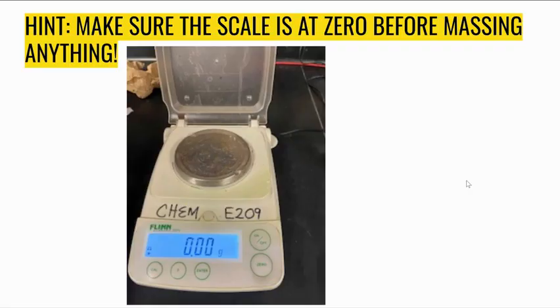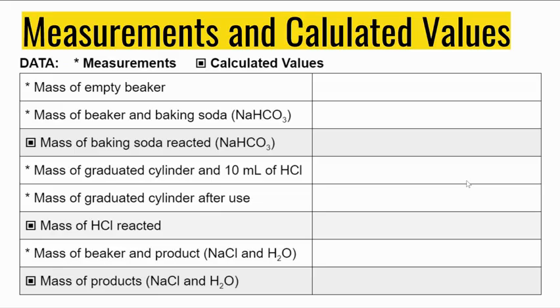One big hint is to make sure that the scale always reads 0 before you mass anything. Small errors in mass measurements become part of writing an error analysis and a percent error statement. So we do have a lot of data we're collecting today.